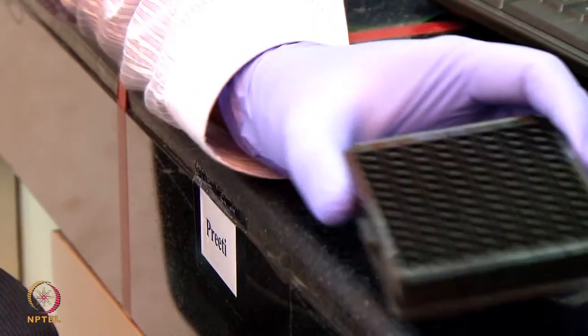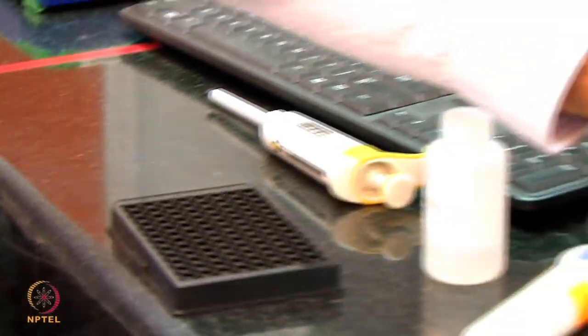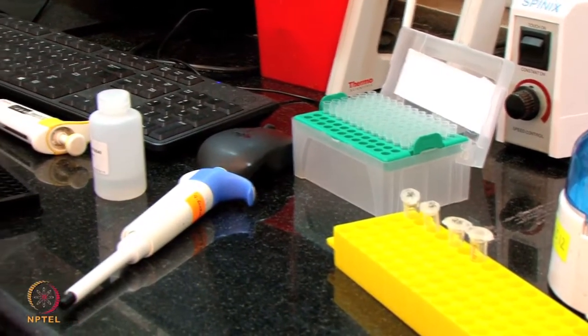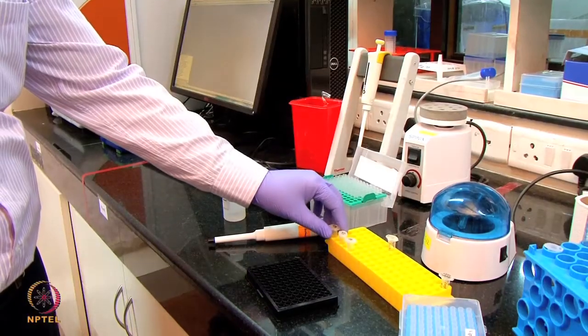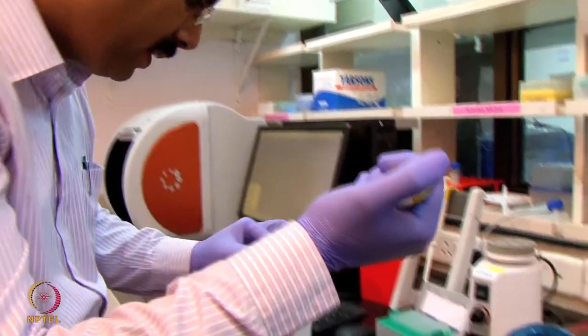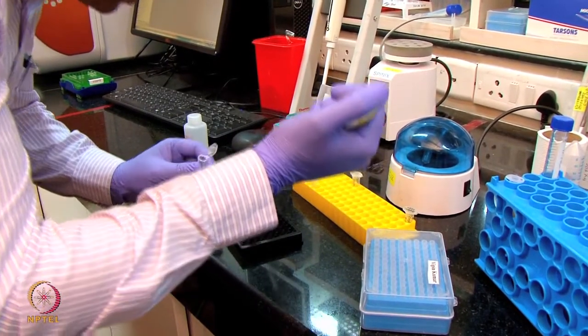Now I am going to add unknown samples. We have 3 unknown samples here, which I am going to put in B3, B4 and B5. With these 3 unknown samples, we are going to determine the concentration of the unknown apolipoprotein using the standard. Now I am going to add the 3 unknown samples here. I am going to place at B3 the sample number 1.